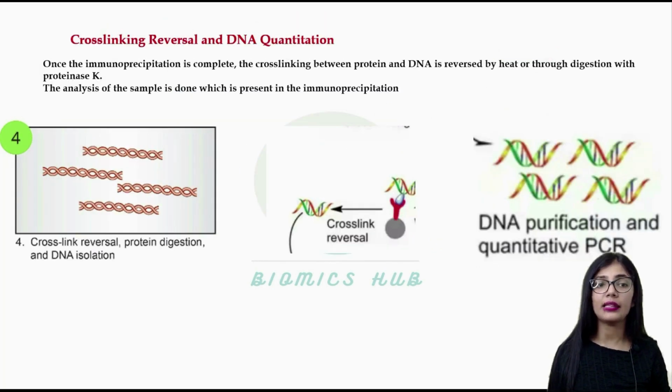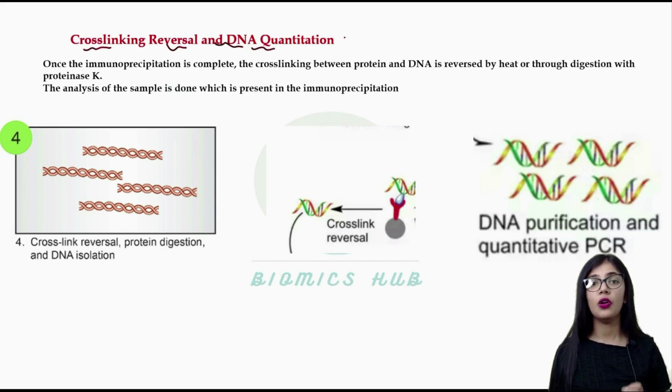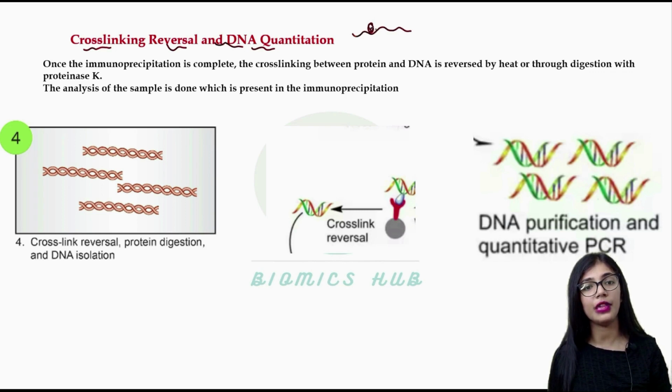Now what next? The next step is cross-linking reversal and DNA quantification. For the strong interaction between the DNA and the protein, in the first step we used formaldehyde.